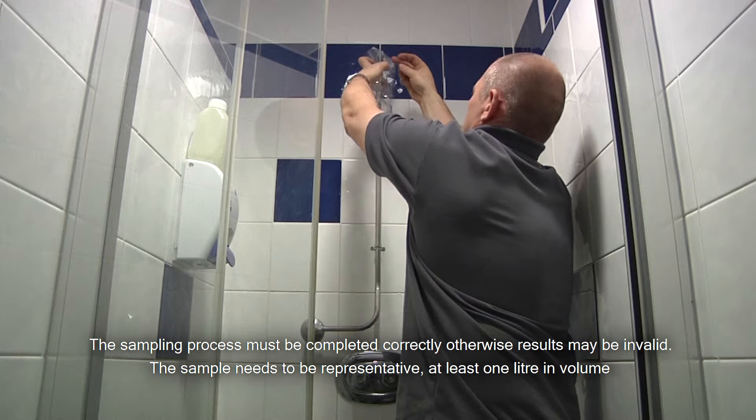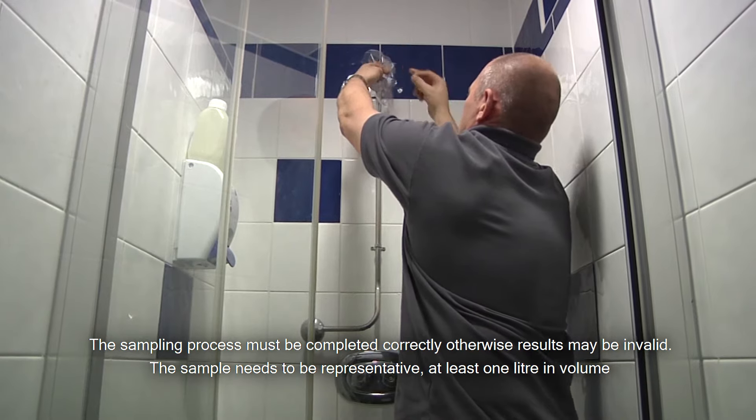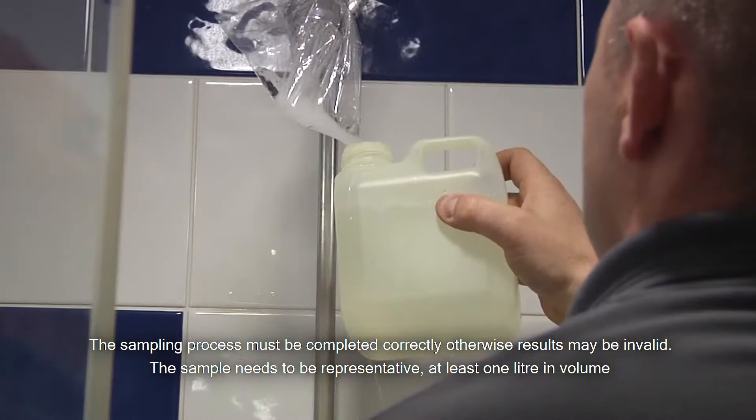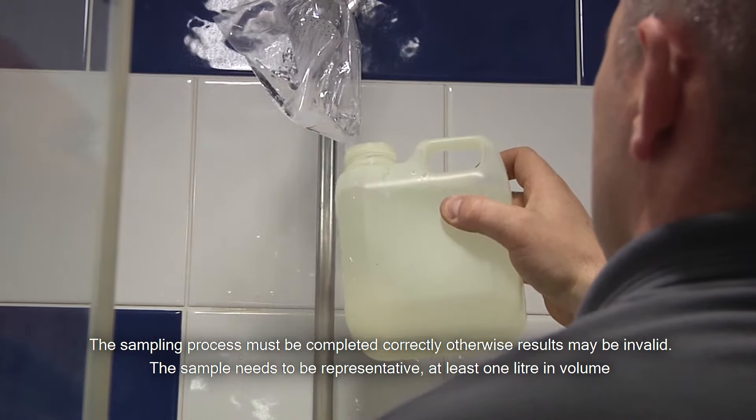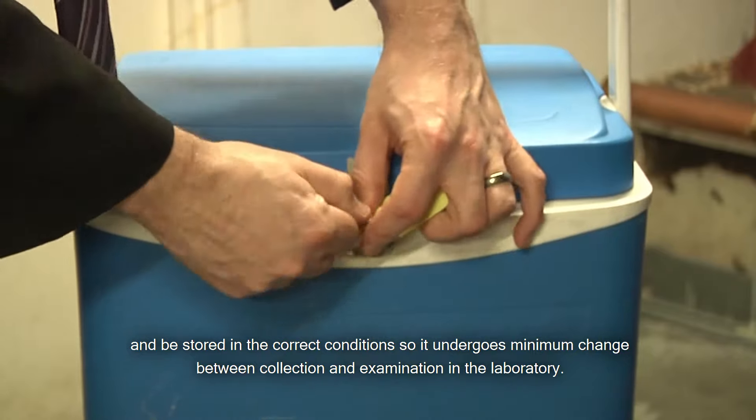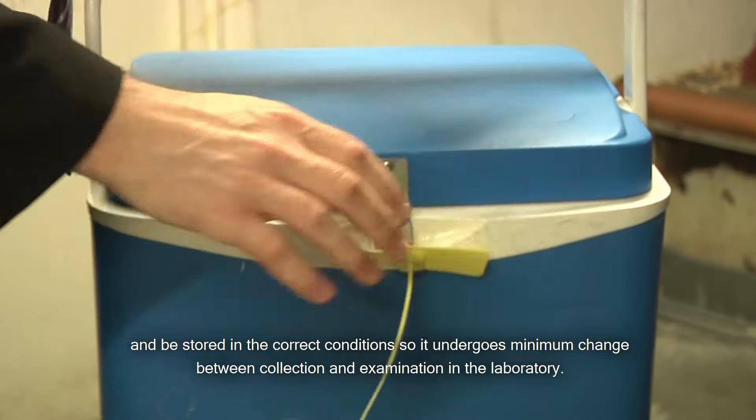The sampling process must be completed correctly, otherwise results will be invalid. The sample needs to be representative, at least one litre in volume, and be stored in the correct conditions so it undergoes minimum change between collection and examination in the laboratory.